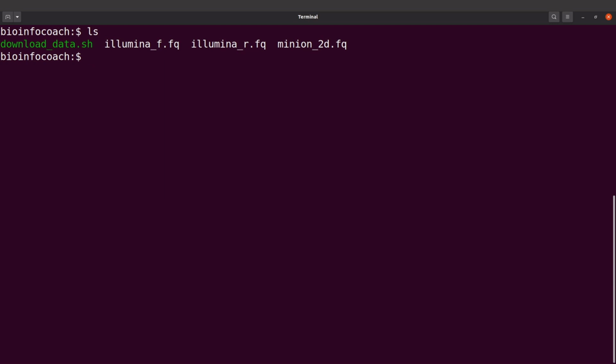Okay, we are now going to install unicycler. We are going to use conda to do this, so make sure you have installed Anaconda. If you have installed Anaconda, then what you have to do next is to add conda channels. We are going to add one channel, and that is bioconda. So I'll say conda config add channels, and I'll say bioconda.